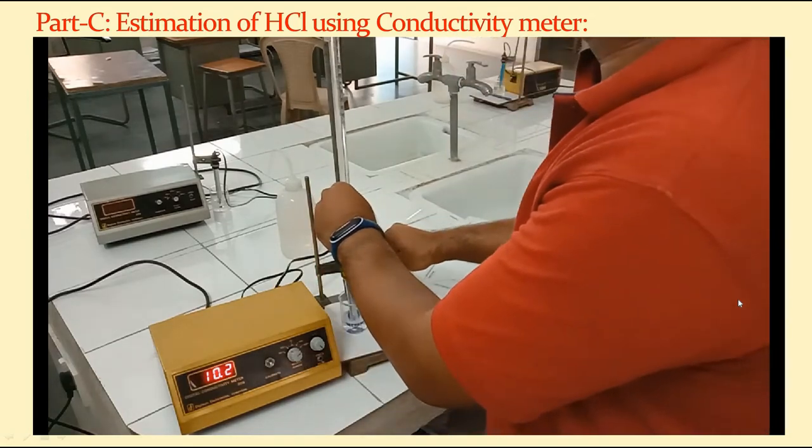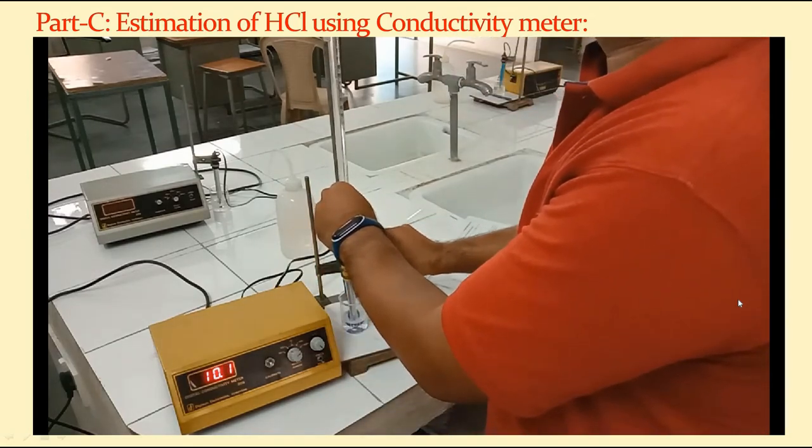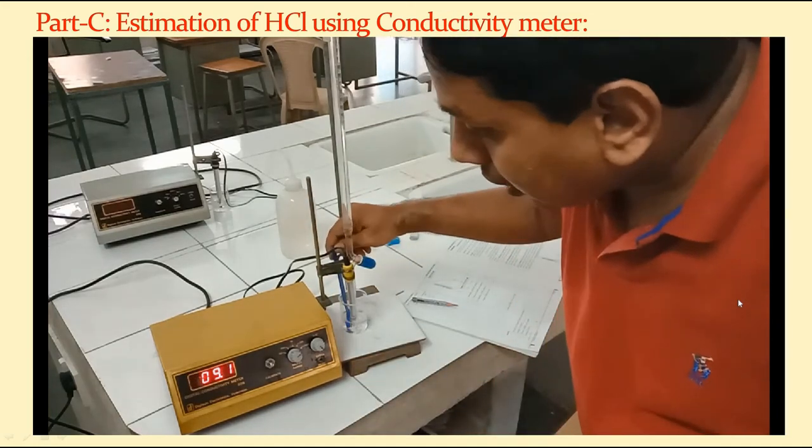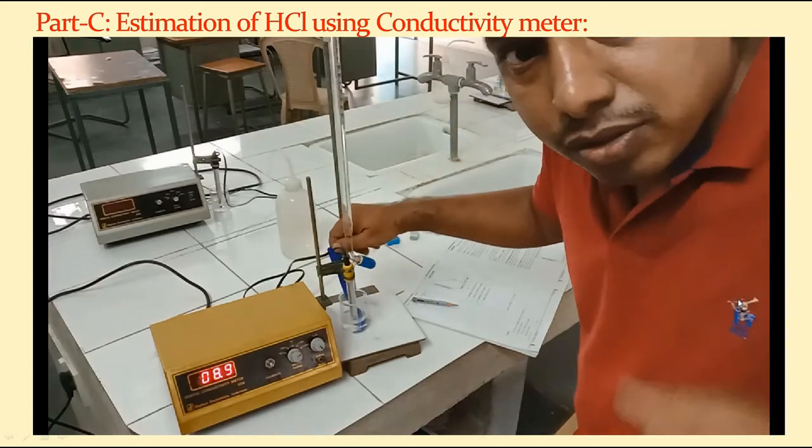Similarly, we keep on adding 1 ml in each interval and note down the readings accordingly. Now you have seen the demonstration of how to use the conductivity meter and conductivity cell placed in the HCl, with sodium hydroxide dropped from the burette. We have observed the conductance, which is recorded in the observation and calculation book.